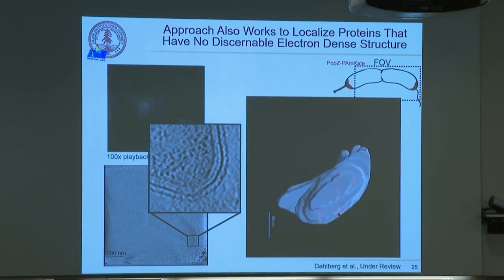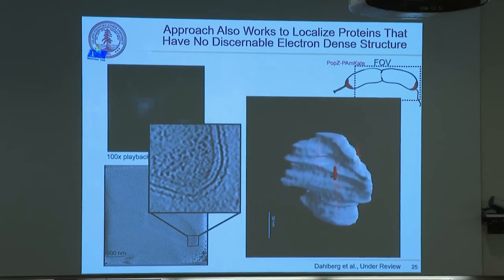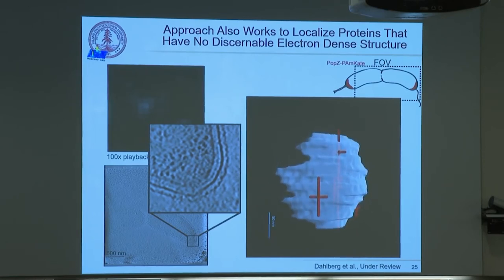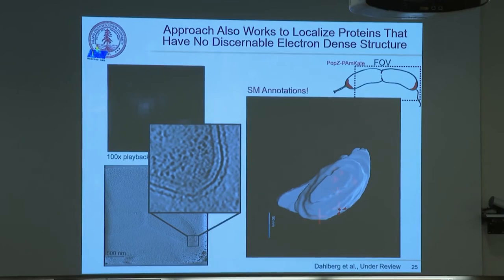So now we can show that you can use this method to say where are the molecules that you can't identify easily in electron microscope images. These are also shown with 3D information with this cross structure, because we also get a little Z information from this microscope using astigmatism. So that's an example of what you can do with single molecules now to try to push into an effect and improve another class of fascinating measurements.